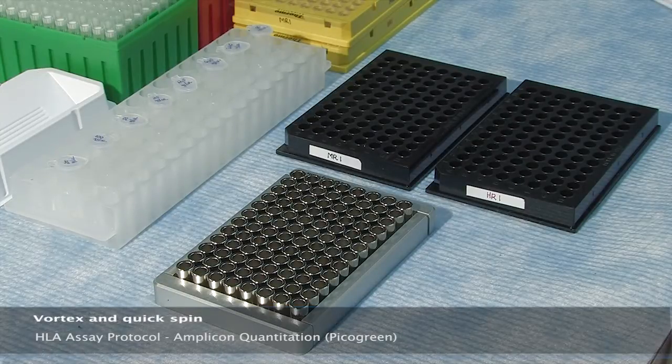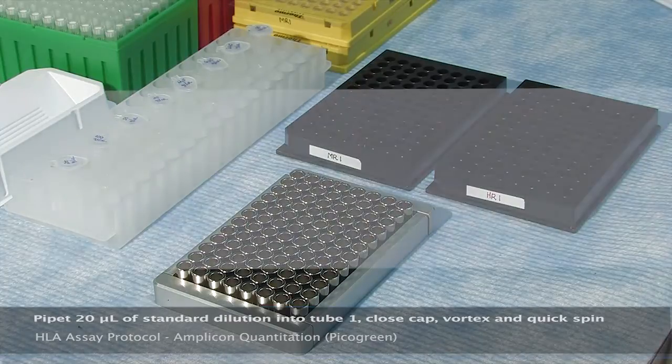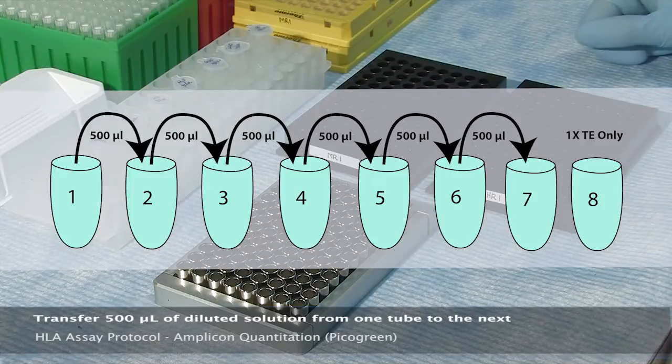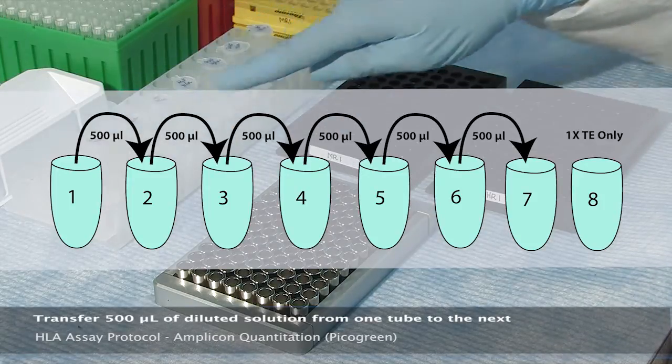Vortex and quick spin the serial dilution of standard and pipette 20 microliters into tube one. Close the cap, vortex, and quick spin. Remove 500 microliters of diluted standard from tube one and add it to tube two. Close the cap, vortex, and quick spin. Repeat this process of transferring 500 microliters of diluted solution for tubes three through seven.